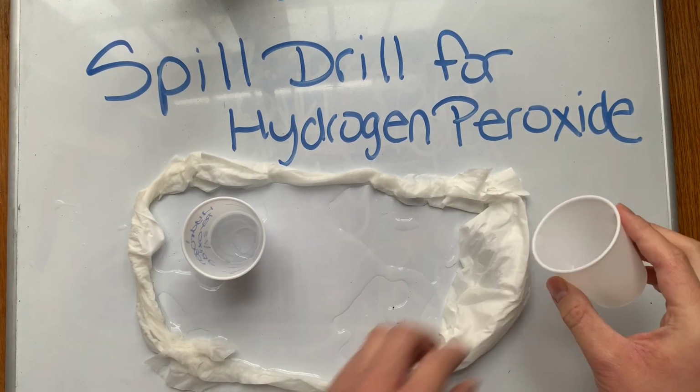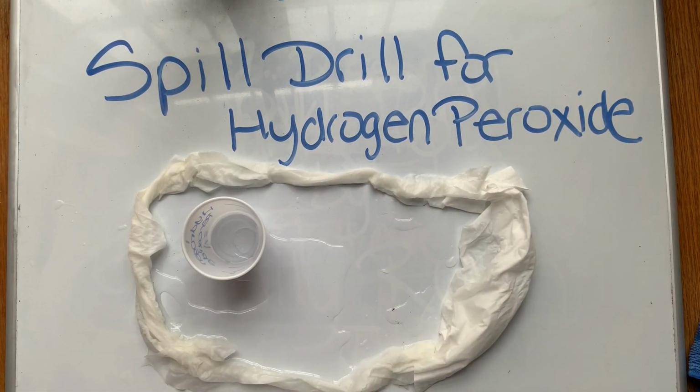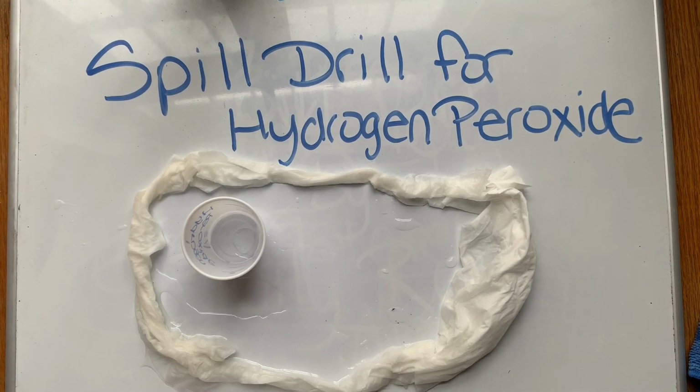Confinement should be started at the furthest point of the spill. Avoid putting the dike too close to the spill, or else there will be a risk of overflowing. The dikes should be heavy enough. A non-absorbent dike contains the flow, but does not absorb the liquid. An important detail to remember is that a dike's height should be 2 times the depth of the spill, while its base should be 4 times its depth.